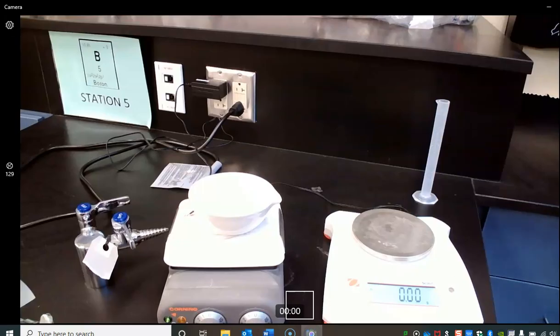Okay, so I'm going to go ahead and turn on the hot plate, and I'm going to let this come to a boil and start to evaporate. I'm going to pause because I don't think watching saltwater boil is going to be a really exciting time for you. And I will restart the recording once we've got some boiling going on.